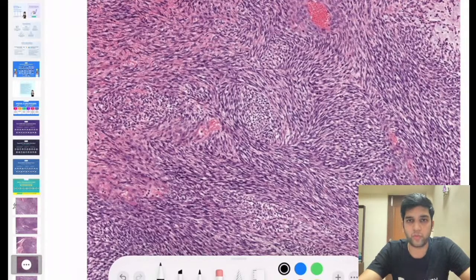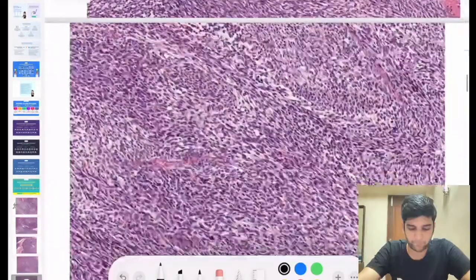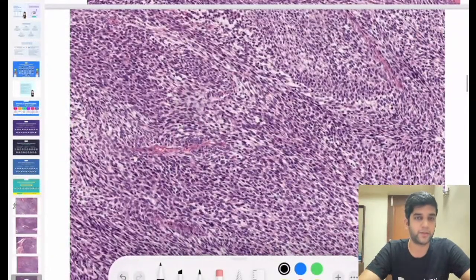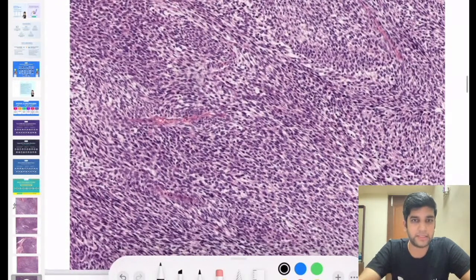SN, you are fine. Sarcoma is a good diagnosis. I think you must be an undergraduate. It's fine. This is especially for postgraduates, and let's see if anyone can come up with a better diagnosis than sarcoma. Sarcoma is obviously correct. Next image. Okay, this is the last, right?